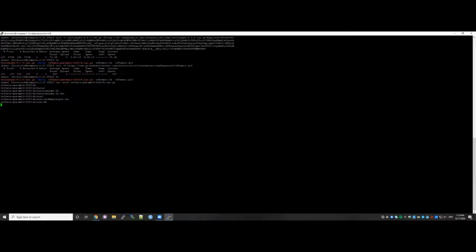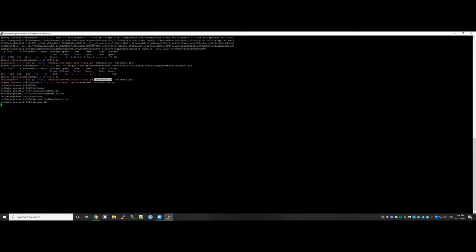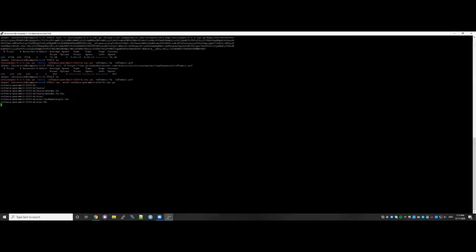Yes. Just going to concatenate this genome.fa with this tdtomato.fa. Yes. And tag genome. Yes. And I'm also going to take the GTF file that should appear next here with this GTF. Okay. And generate a tag GTF file. Yes. And then I'm going to make the reference again. Oh, I see. How do you add these two together? I will show you.